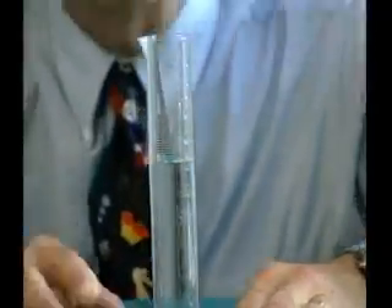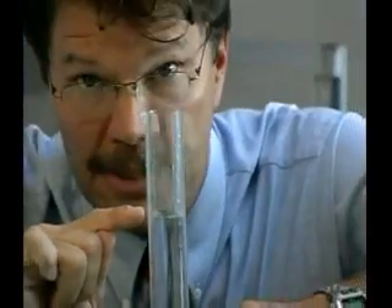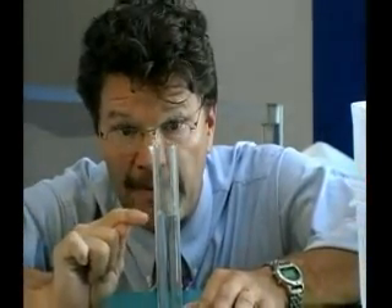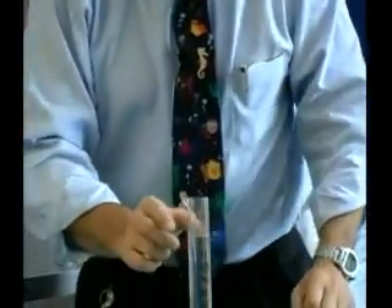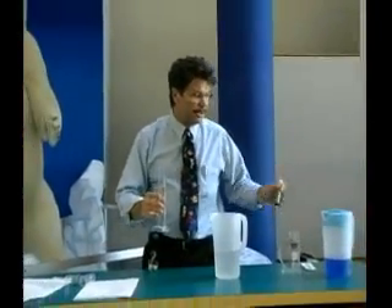If I get down a little bit closer here, you can see that there are different markings. Sometimes the water will be curved — you want to look at the bottom of the marking. It's important to know the volume of a liquid when you're trying to learn certain things, such as flow or how much it takes up. We have different graduated cylinders for smaller amounts.